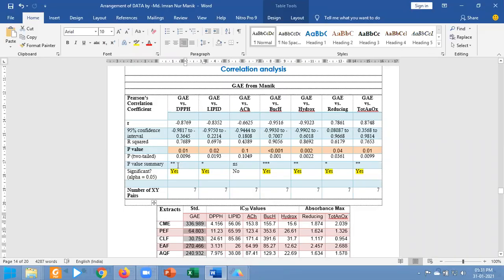I have taken the significance values in Microsoft Word, and you see that the correlation between gallic acid and DPPH has been signified with two asterisks, and gallic acid versus lipid with one asterisk, and so on.